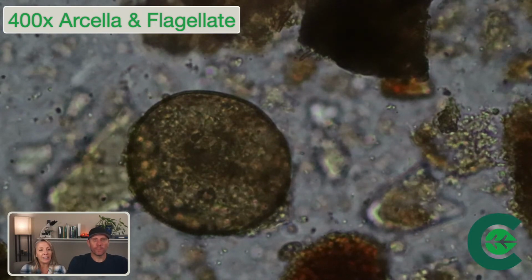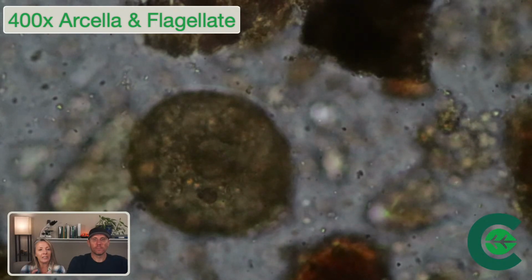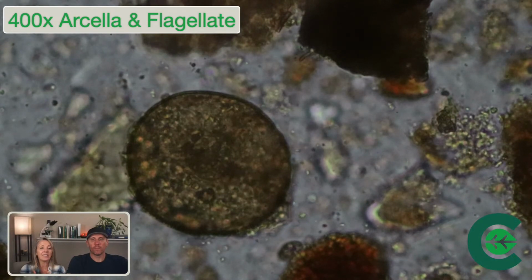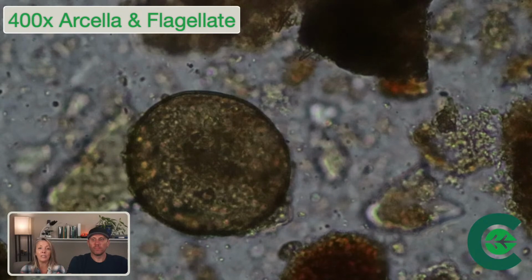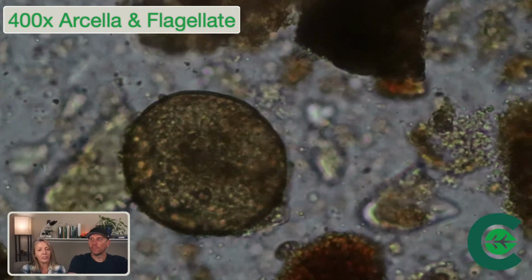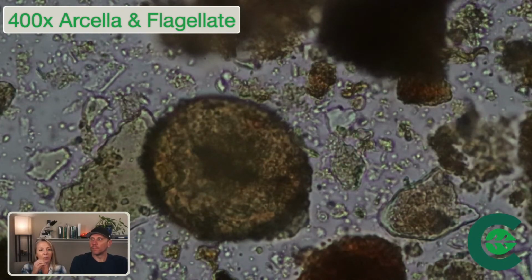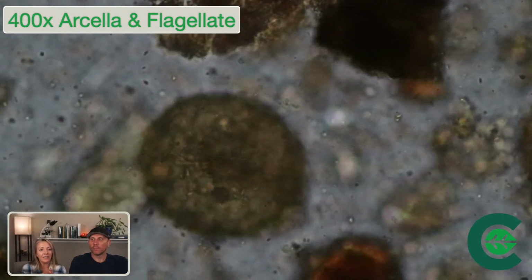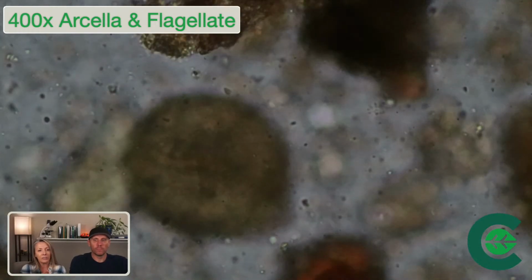The big guy in the center that's nice and spherical, he looks like he's perfectly constructed. That is a perfectly constructed shell of an Arcella amoeba. It's a type of amoeba. When I'm focusing up and down, you can't see it right at this moment, but there'll be a round portion in the center, right in there. You can see that that's the center of the amoeba there.